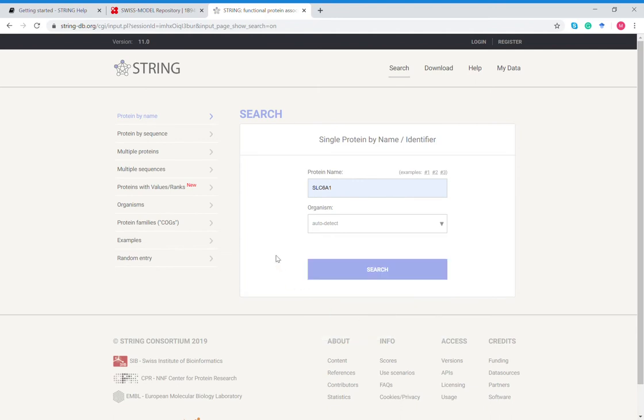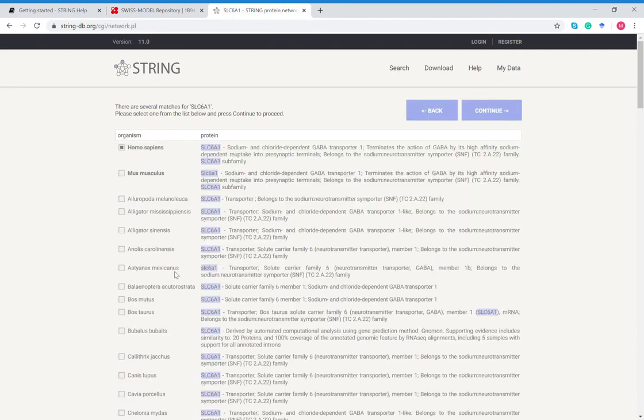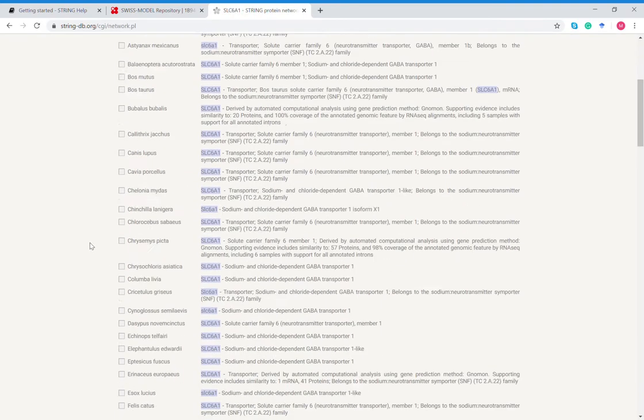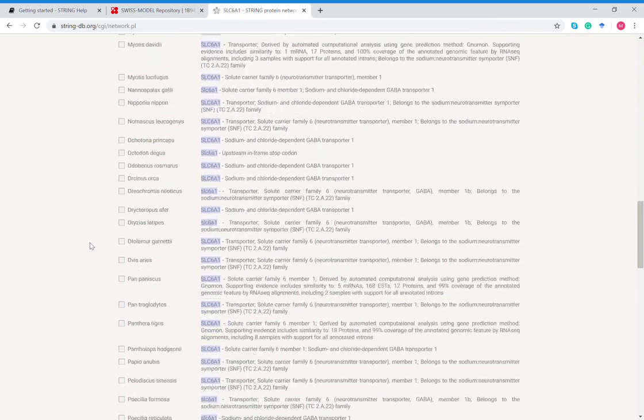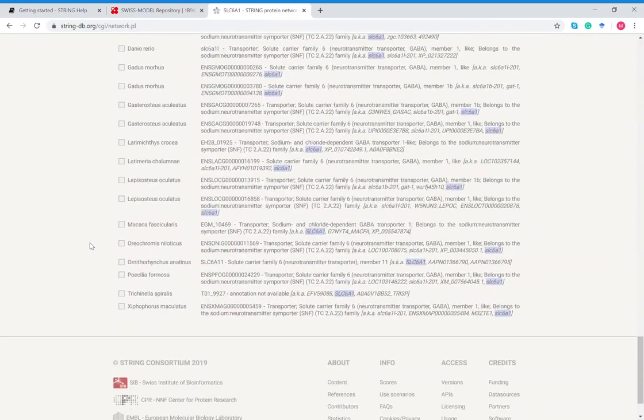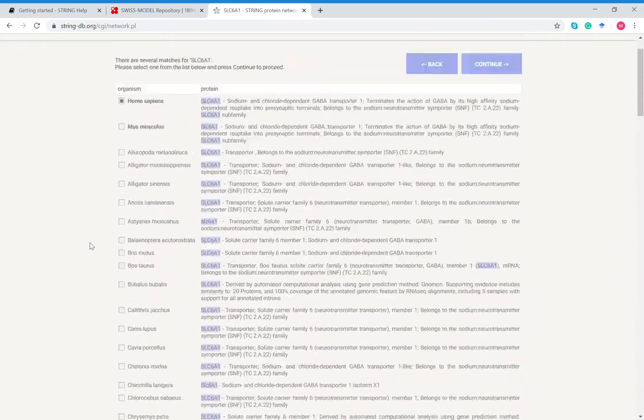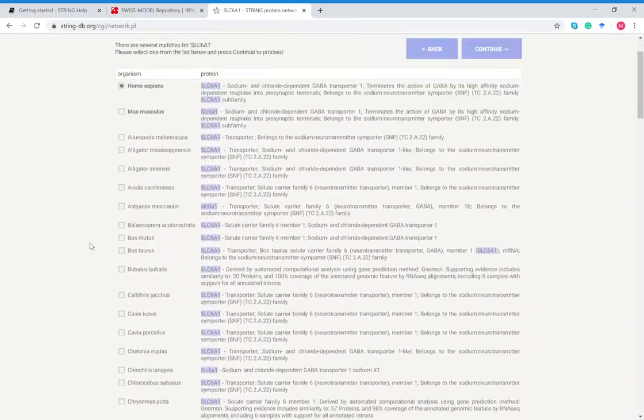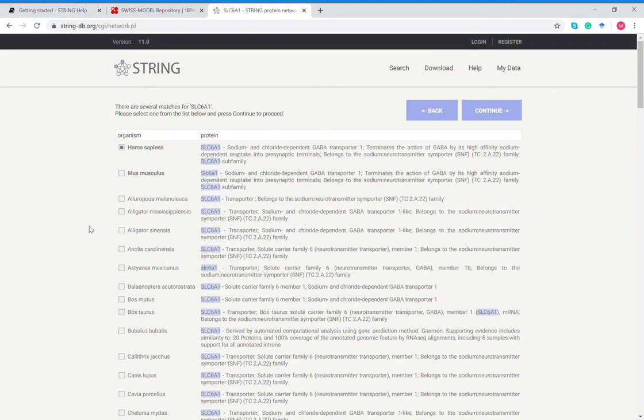This is all of the organisms that have SLC 6A1 protein that can be expressed in their genome. We will specifically look at homo sapiens, so you click that box, you can click all one box at a time, so homo sapiens and then continue.